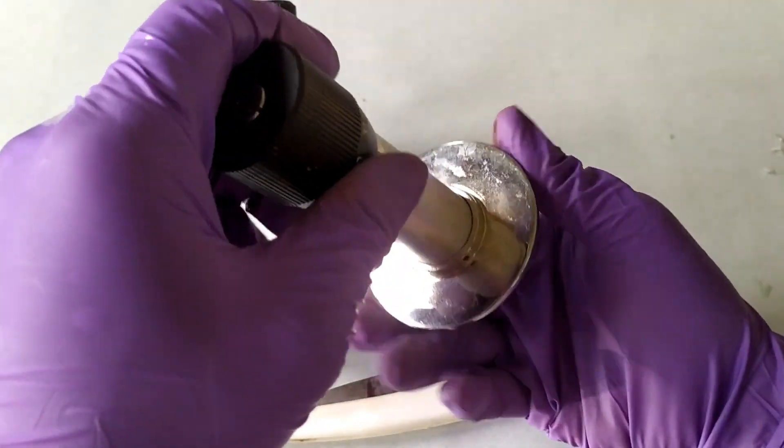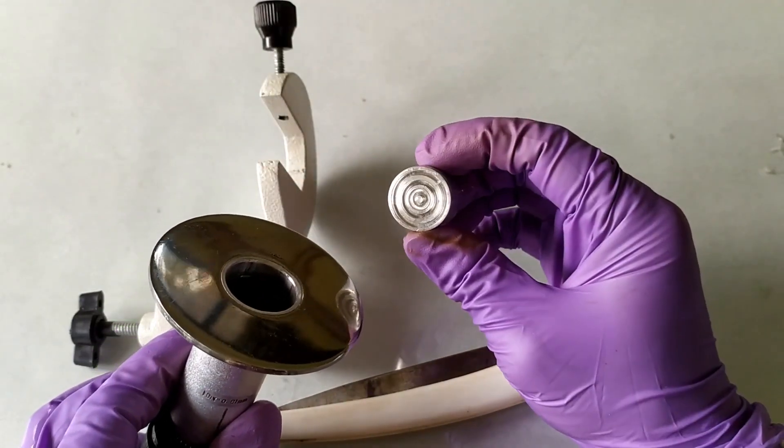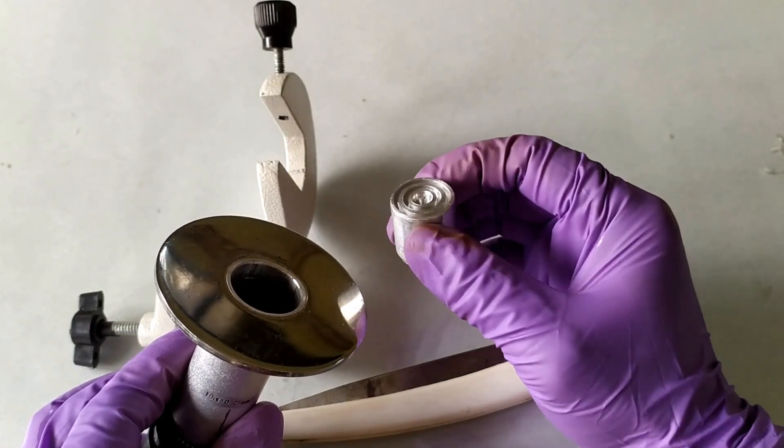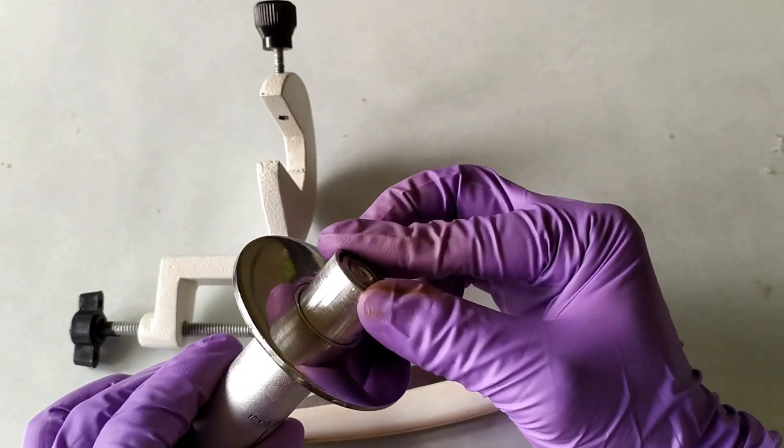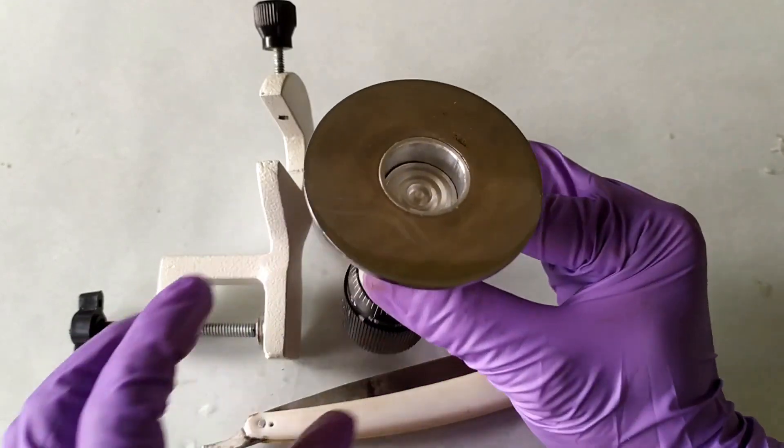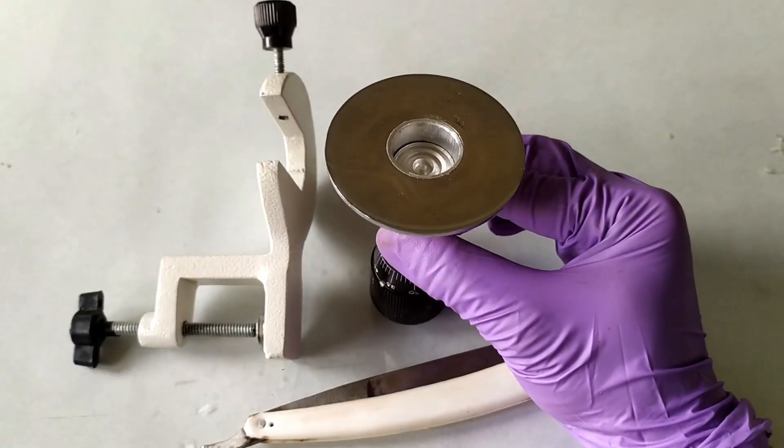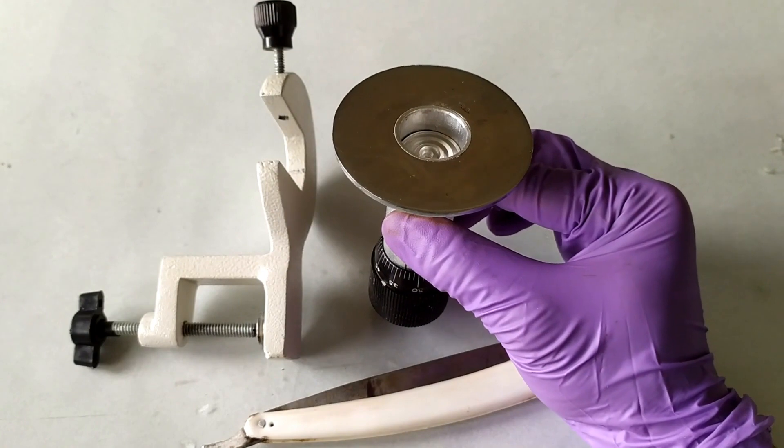One point to be noted here is that the hand microtome is designed primarily to cut sections that have been embedded in a pith material such as carrot, potato or even a paraffin wax block. The material is supposed to fit tightly in the sample holding groove for efficient sectioning.